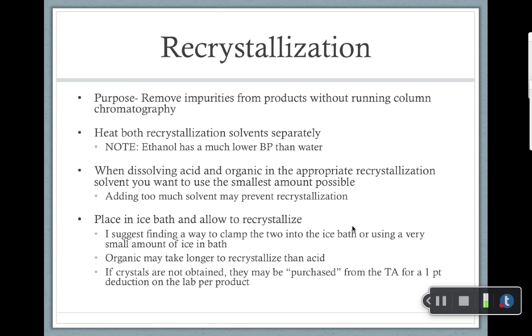Once you have added the small amount of the recrystallization solvent to your organic or acid, you're going to place it into the ice bath to allow it to recrystallize. I would suggest that you find a way to clamp the two into an ice bath, or to use a small amount of ice in the ice bath. The other thing you could do as well is use a smaller beaker and create an ice bath in that, so that it doesn't tip over.